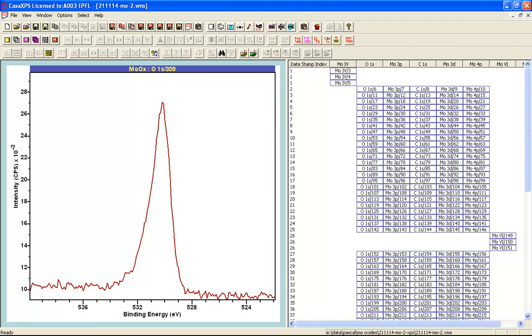Analysis of a data file is enhanced if we understand how data are organized. It's also important in terms of quantification. If you want to compare intensities from different elements from the same sample measured at the same time, it's important that these are all collected together in such a way that we can easily identify spectra that belong to the same measurement. So this is an important part of analyzing data, is to maintain an integrity of the data that are collected at the same time.